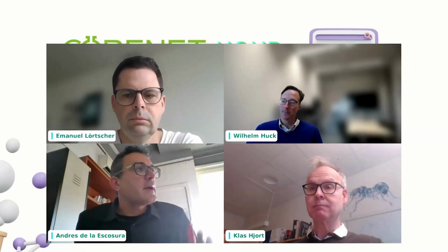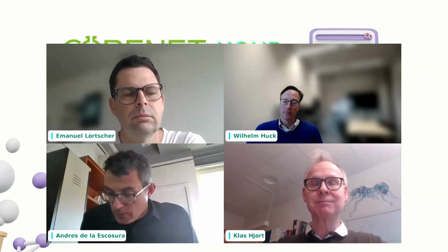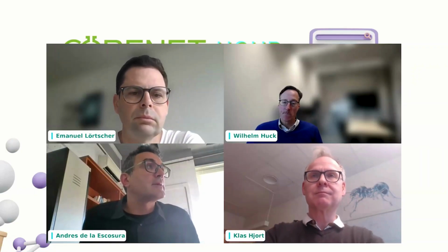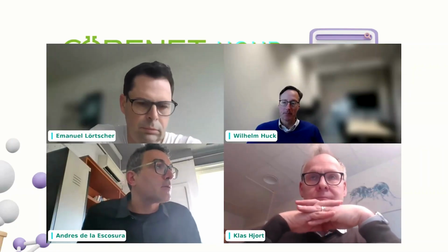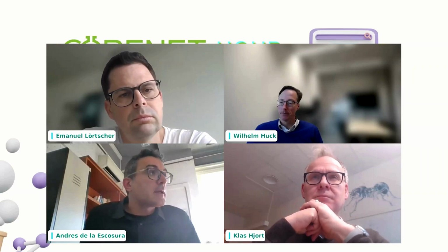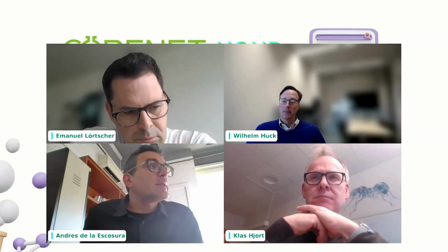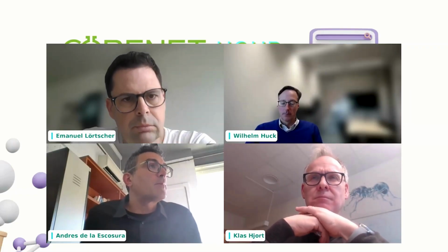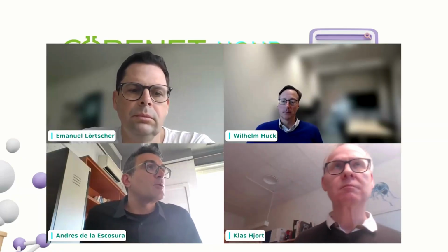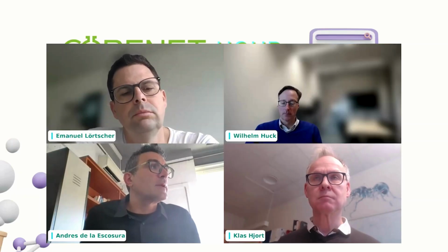Thank you, Wilhelm. Klas, I have one question, and maybe Emmanuel and Wilhelm can then intervene if they consider it. One of the important things in the project is the inline analytics that comes out of the reactor, of the composition of the CRNs. I liked a lot the last part of your talk, and I was wondering what type of detection methods you could couple to these high pressure, portable HPLC columns and so on? Could you couple that to a mass spectrometer, other spectroscopy techniques?